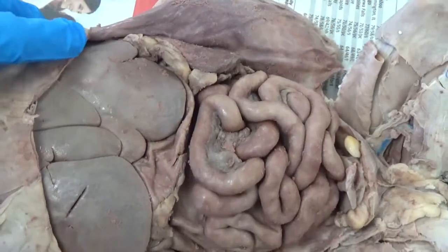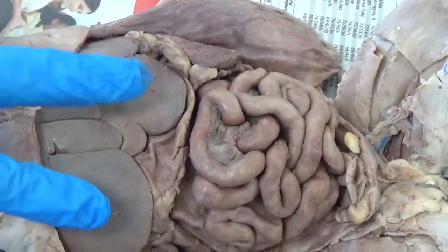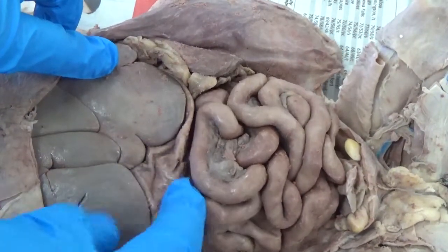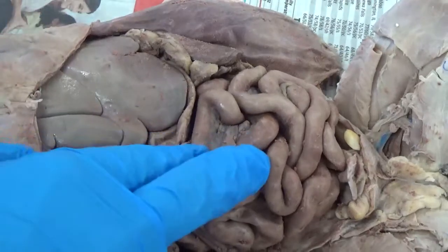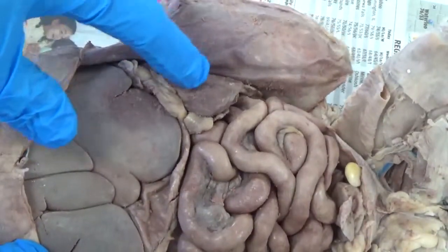So the main things that you can see in the abdominal cavity would be the liver, and you'll notice that it's divided up into multiple lobes. Right below the liver, this little flap that you can see is the stomach. Then we have the small intestine, and this right here is the spleen.